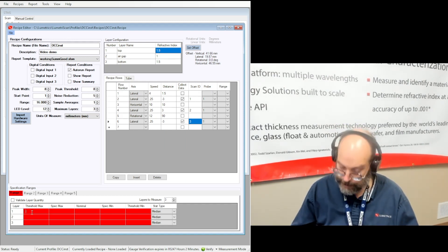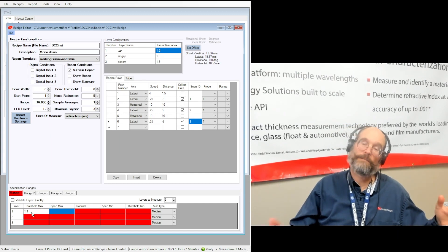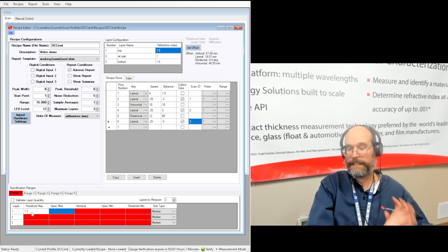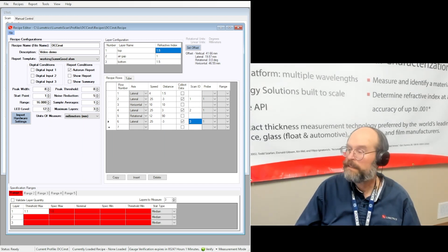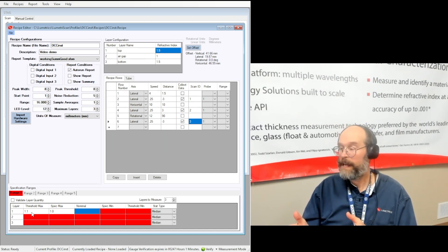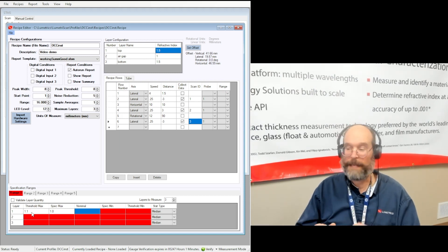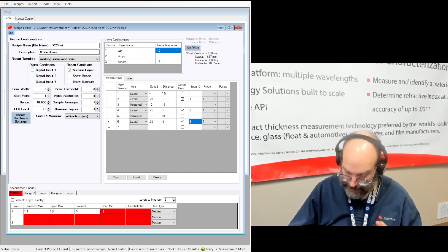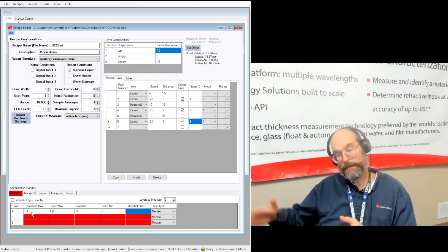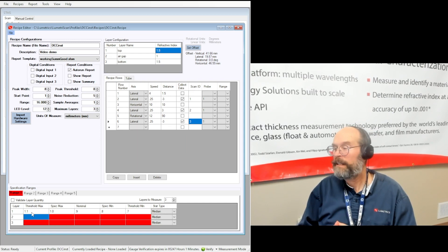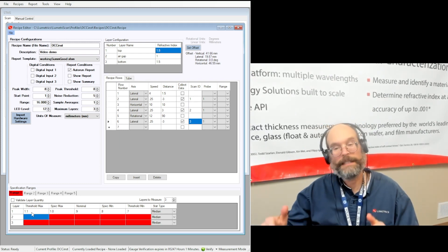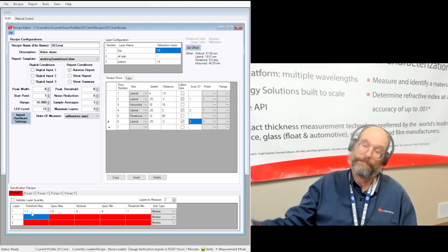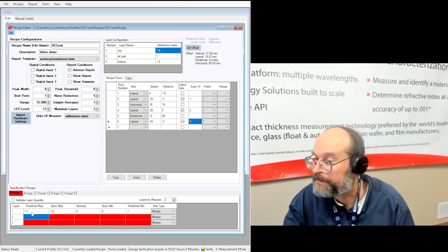So the threshold max 1.1. So anything greater than 1.1 is going to be ignored, or at least won't go into the filtered data. You'll have it in the unfiltered data, but it won't go into the filtered data. And then the spec max, we'll call it 1.0. So now anything below 1.0 and between the spec min will be considered in spec. The nominal is 0.9. And we'll just say for the minimum is 0.8. And for the threshold minimum, so what are you going to throw out that's too small, let's go 0.7. So we're keeping it simple there.